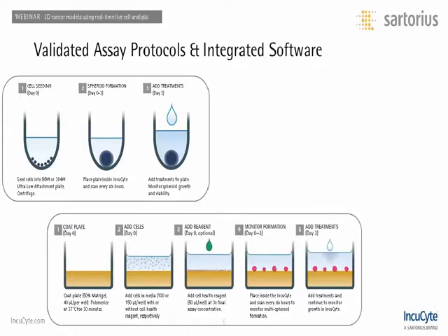Again, there are several ways to create multispheroids using ECMs. This schematic describes a workflow for creating and monitoring multispheroids which have been created on a base of Matrigel in 96-well flat-bottom plates. Although not shown here, we also describe a protocol for tumor multispheroids created within a sandwich, if you will, of Matrigel. That is to say, cells are seeded on a layer of Matrigel followed by an additional layer of Matrigel which is added on top.